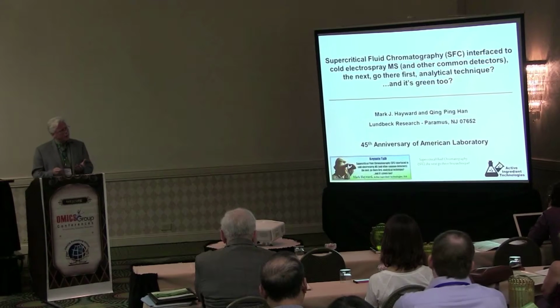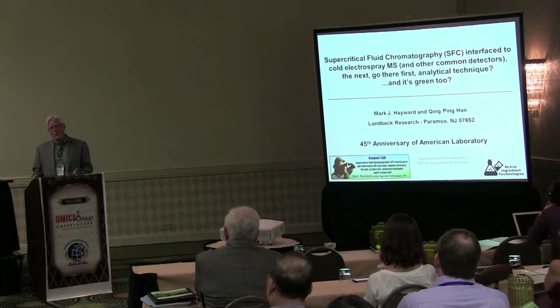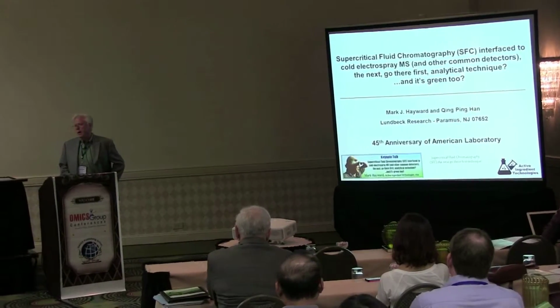So for us, we're thinking about the science, getting that high quality separation, but at the same time, we've got to get a lot of work done. And if the detection doesn't work so well, we're not going to be able to get a lot of work done. So this presentation is about addressing those detector issues and getting the quality where we want it to be.